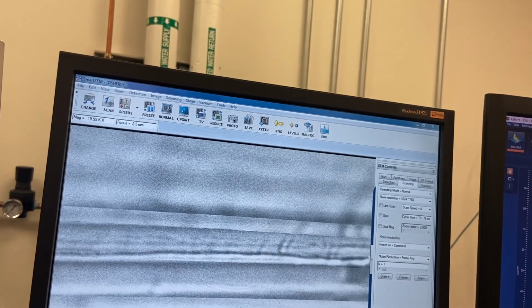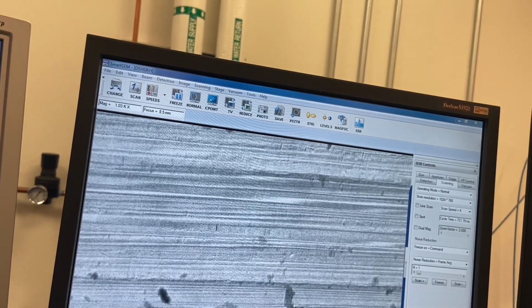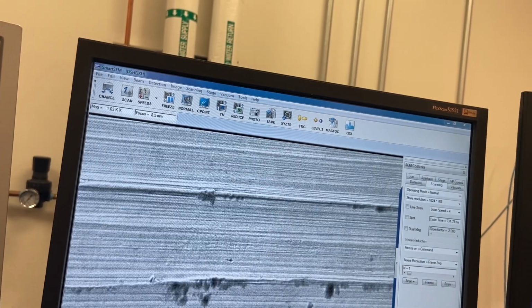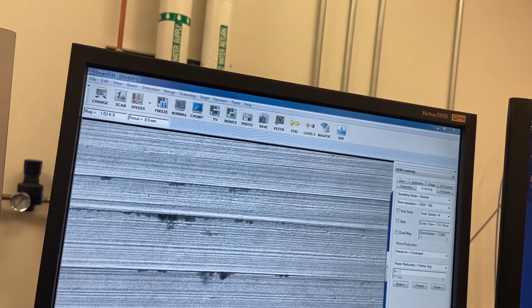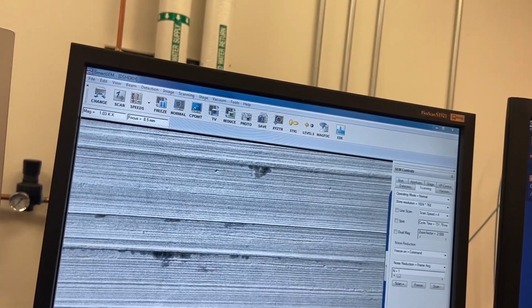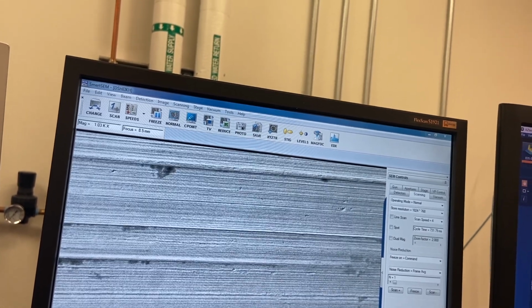Now I'm going to zoom in somewhere. That's a little too far. Somewhere about here. See all these little dark spots? We want to go somewhere that's free of them. So let me see if I can find somewhere here. All right, it doesn't look perfect here, but maybe this, or at least minimal. Let's try somewhere here. All right, we'll try this and see.